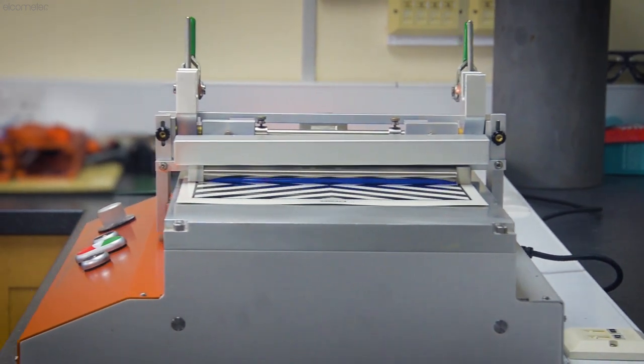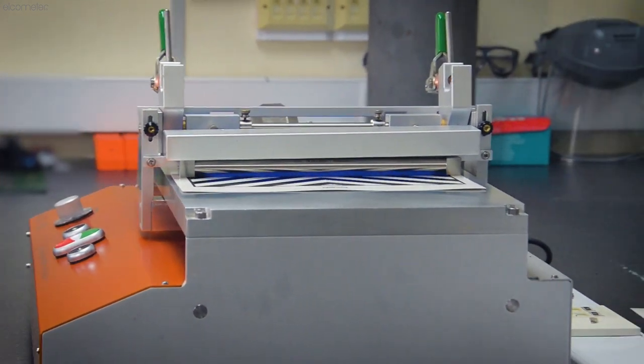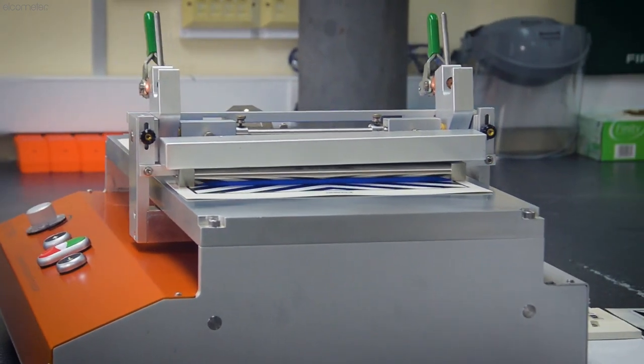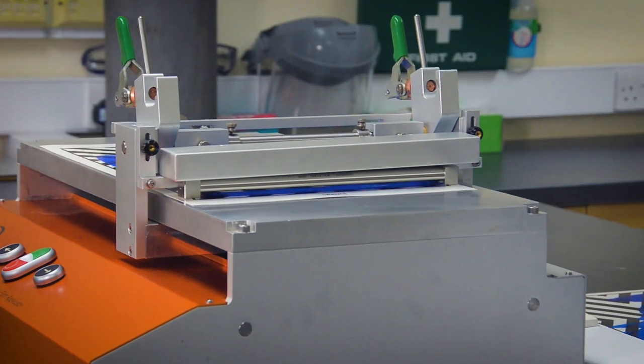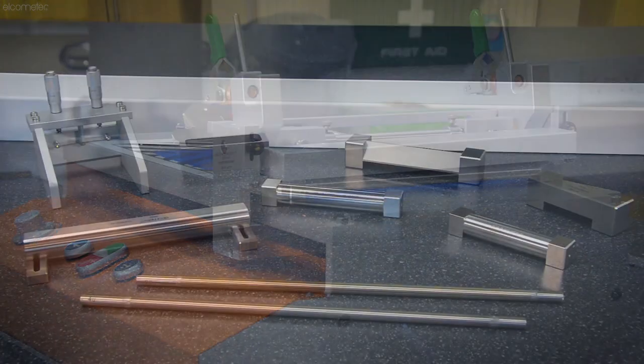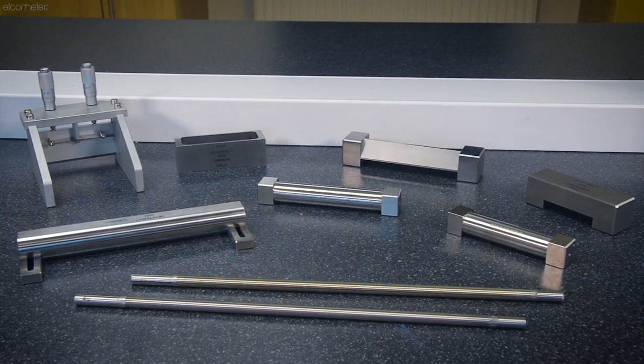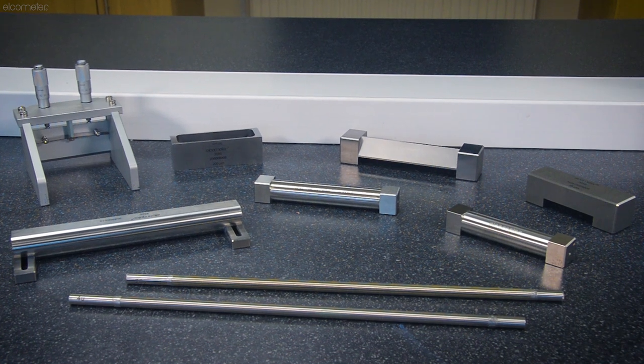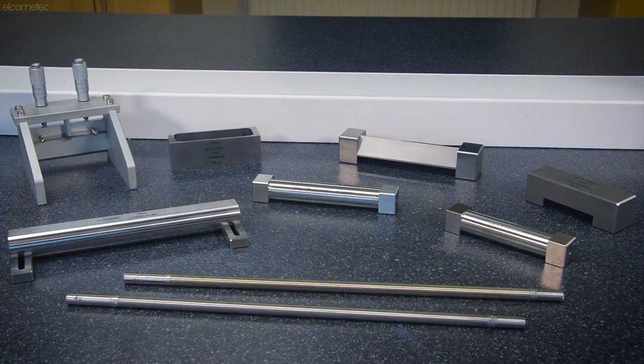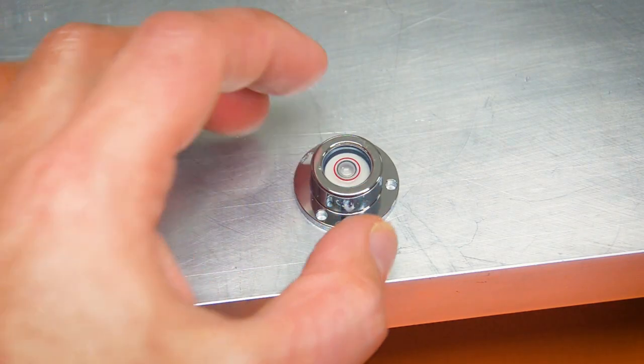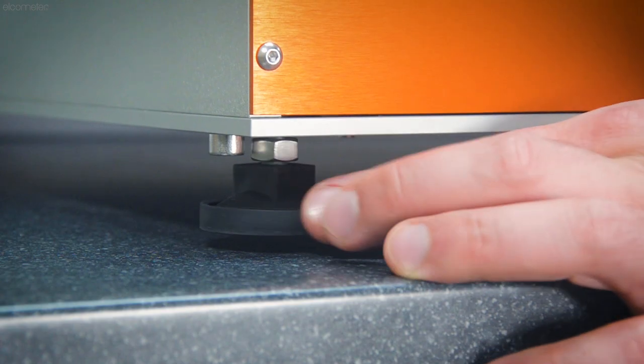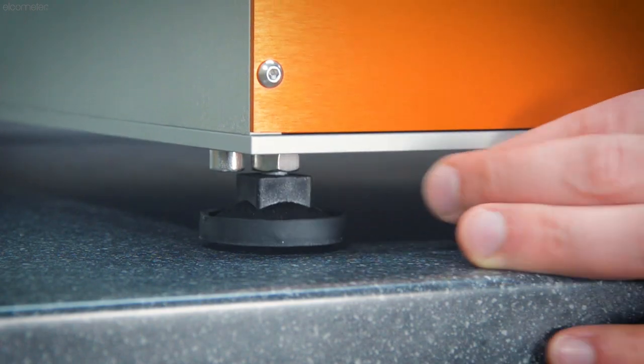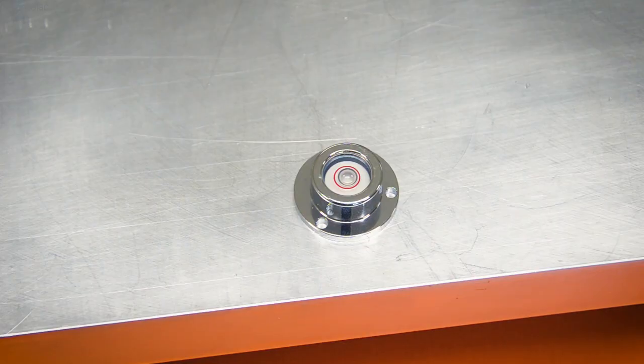Before we get started, for a full introduction to film application and the Elcometer 4340, check out our introduction to film application video and our applicators explained video, detailing the full Elcometer film applicator range. To begin, place the supplied bubble level on the table and adjust the feet of the unit until the table is level.